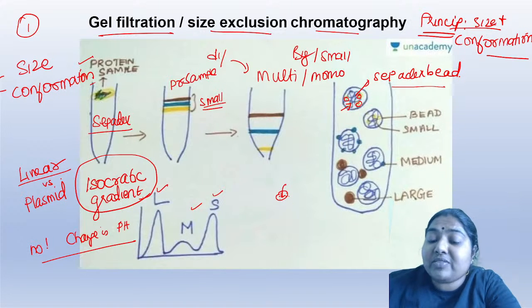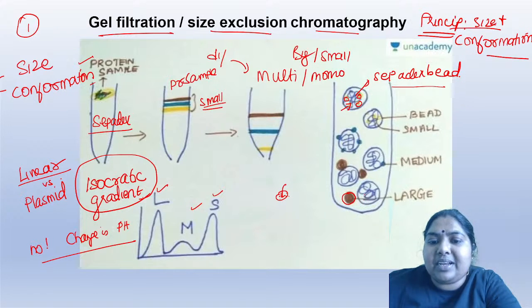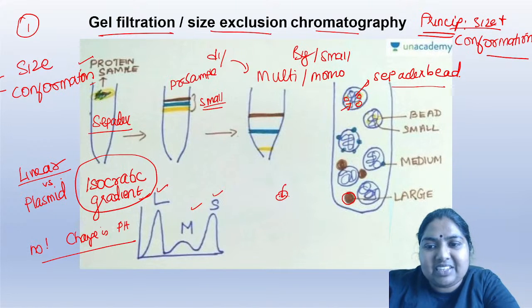But imagine what will happen to my large protein. Can it enter inside the filter? Can it enter inside the filter if I am having a very large protein? Can it go inside the filter? Definitely not, isn't it? So it will never go inside.